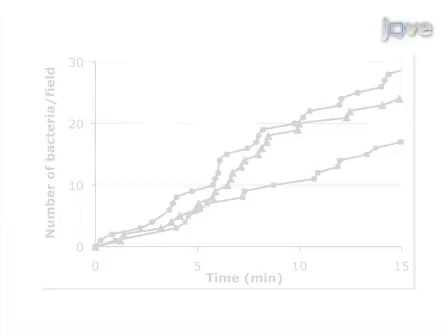The resulting videos are analyzed to determine the effect of shear stress on the process of endothelium colonization.